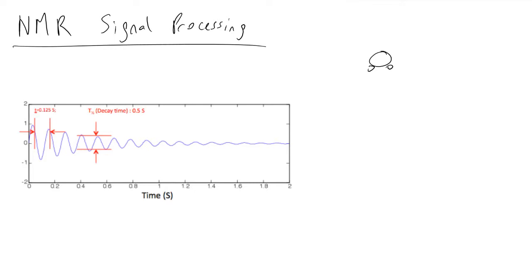We know we've got two protons, and these protons will spin either with or against the applied magnetic field, commonly denoted B0. And as we're applying this magnetic field, these spins will rotate with some kind of precession. And this precession, referred to as the Larmor frequency, is something that is detected by the radio frequency transmitter. And the radio frequency transmitter will output some voltage at a given time.